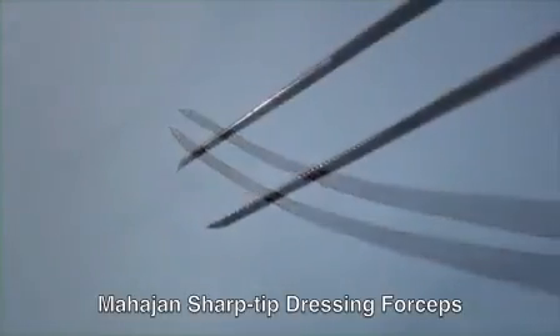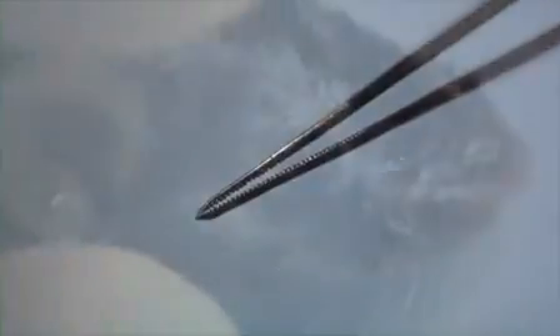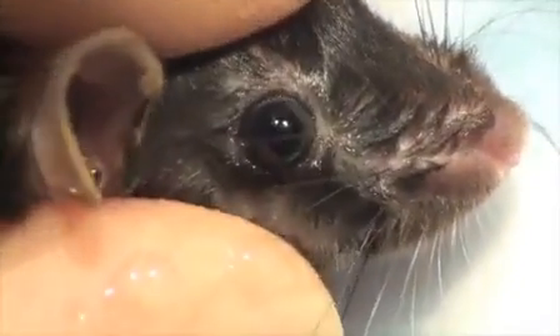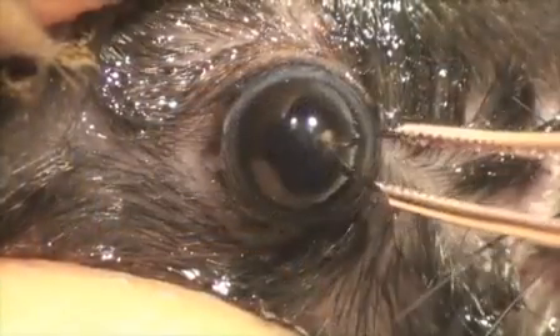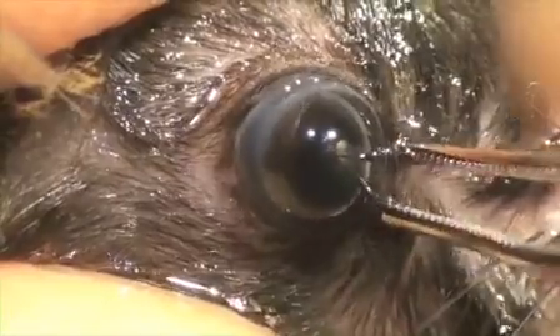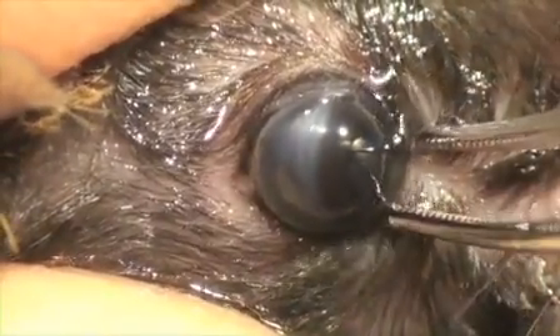Form a blunt dissection using a curved dressing forceps customized with a sharp tip. Begin by pulling apart the eyelids. This tends to proptose the eye out and away. Carefully use your forceps to go into the orbit and behind the eye.